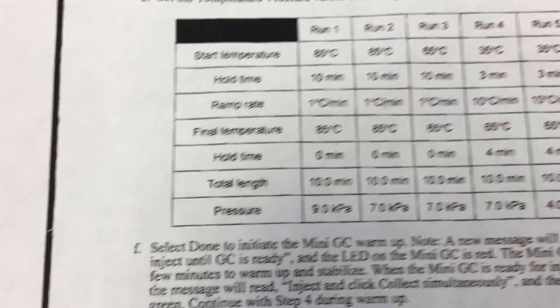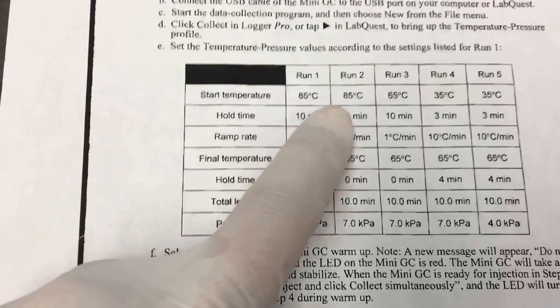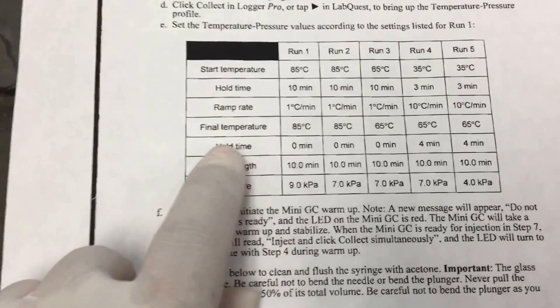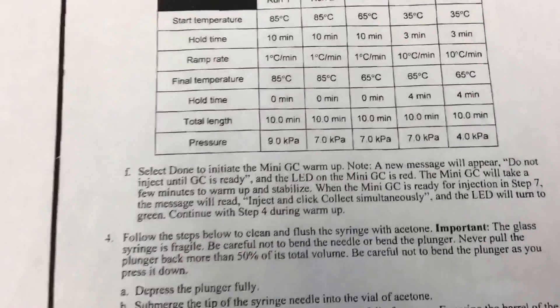Once you're set up, you need to configure your parameters according to your run — run one, two, three, whatever needs to be done. You set the start temperature, hold times, and the ramp rate.